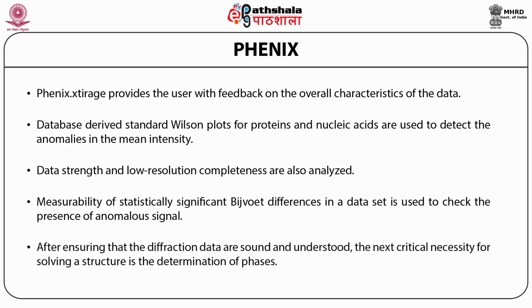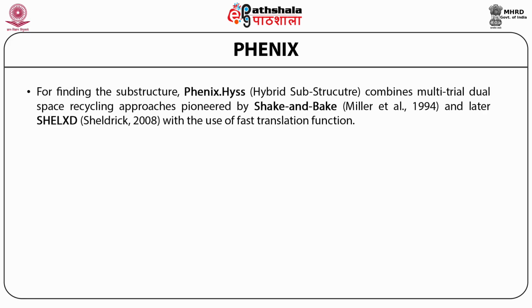After ensuring that the diffraction data are sound and understood, the next critical necessity for solving a structure is the determination of phases. For finding a substructure, we have a program called PHENIX.HYSS, hybrid substructure search, which combines multi-trial dual space recycling procedures, pioneered by Shake-and-Bake, written by Miller et al. So I was also a part of this program in the initial stages when I worked with the Nobel laureate Professor Herbert Hauptman at the Medical Foundation of Buffalo, New York. Shake-and-Bake is a program where a minimal function is used.